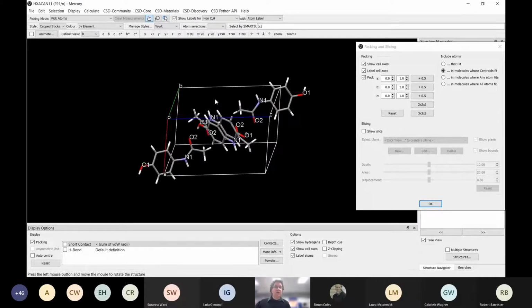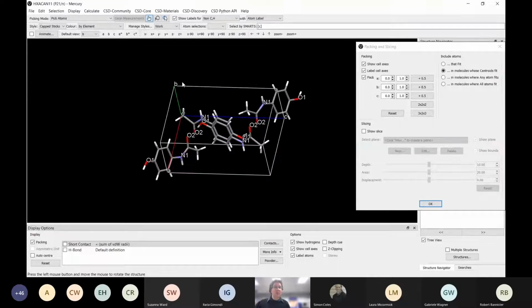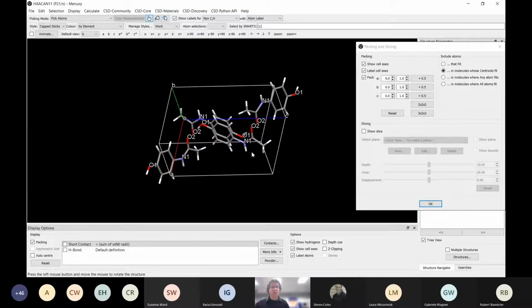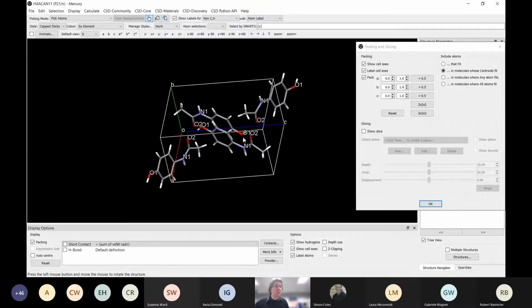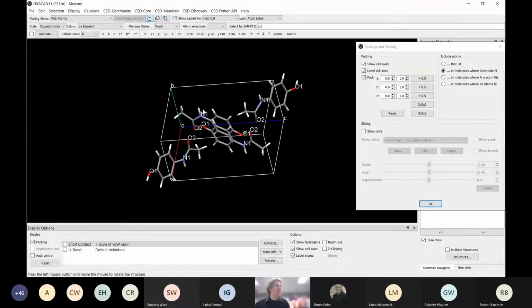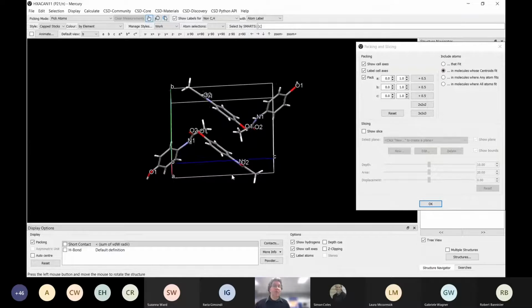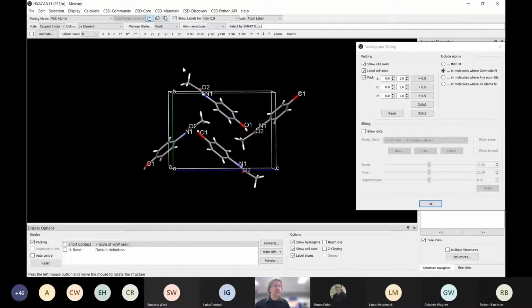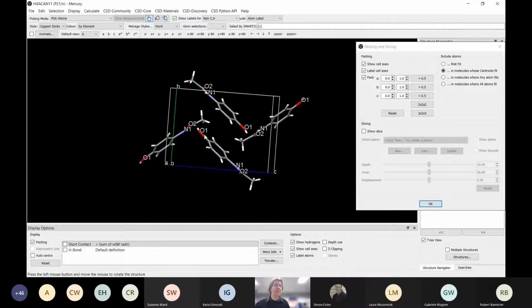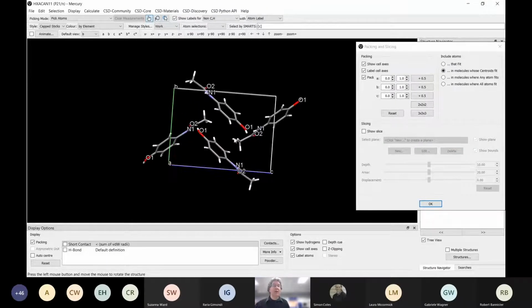which can be. Now you also see that we have the unit cell and they're labelled, so we can see the A-axis, B-axis, C-axis, and other things. Just to let you know, as I say, this is the unit cell, the imaginary construct that allows you to take this and translate it in every direction, and you build up the crystal. And as you can see, every single one of these molecules doesn't lie within the unit cell; it goes in and out. And this is actually pretty common. Most of the time, you'll have your molecules going in and out of a unit cell.